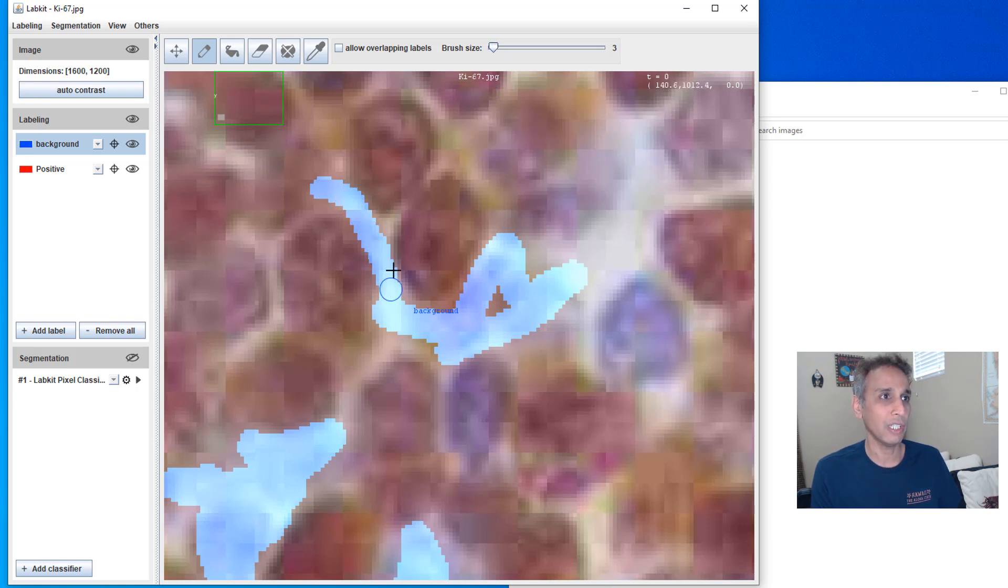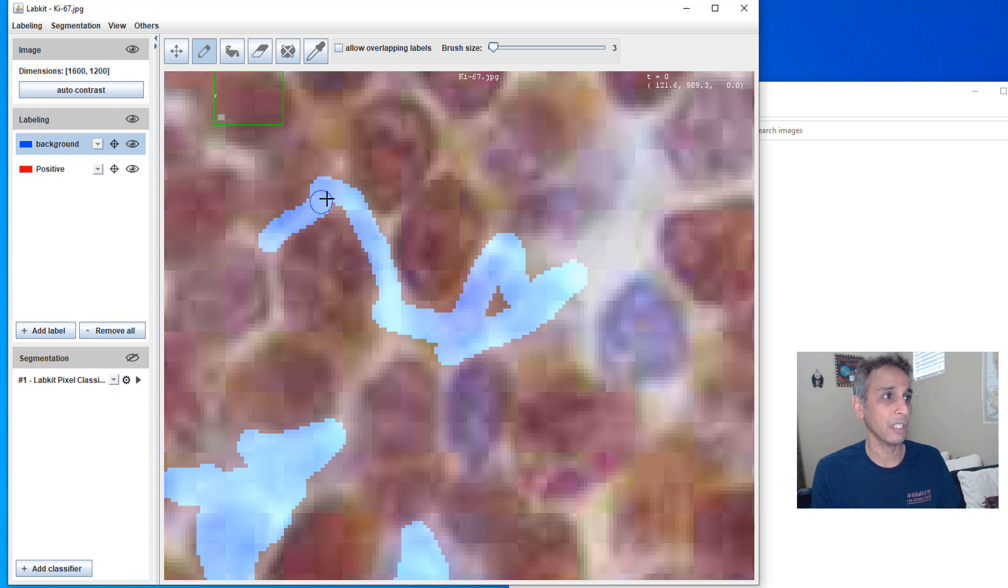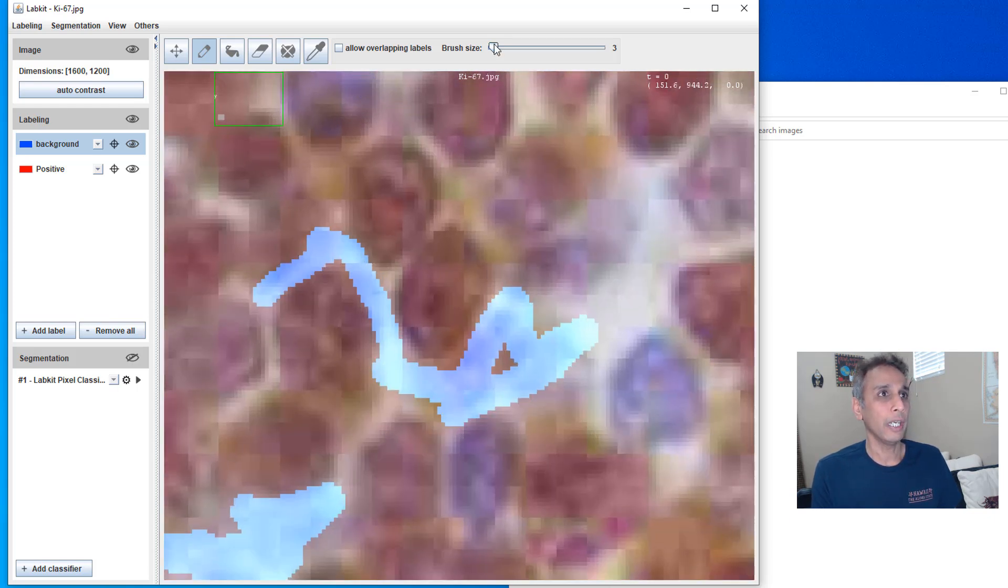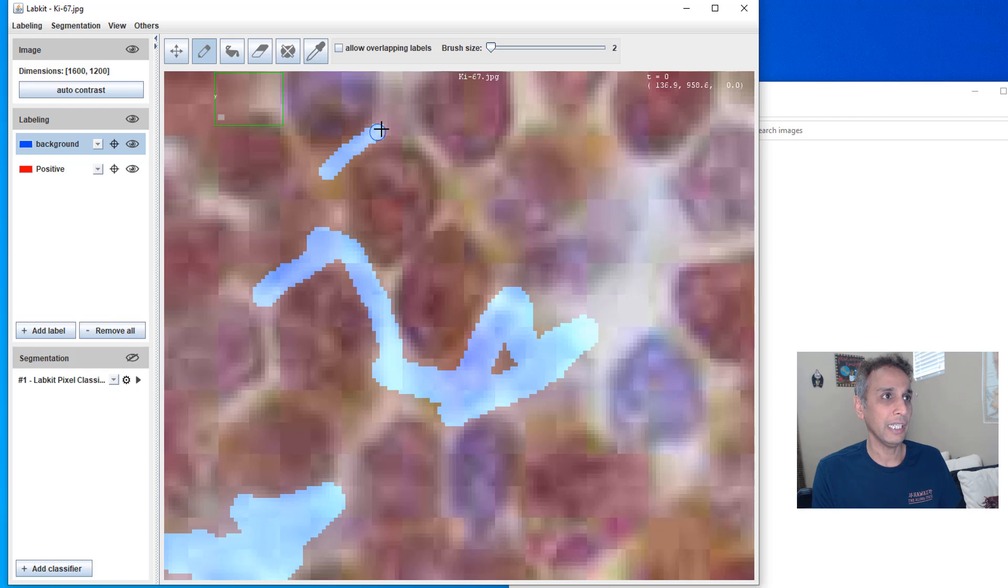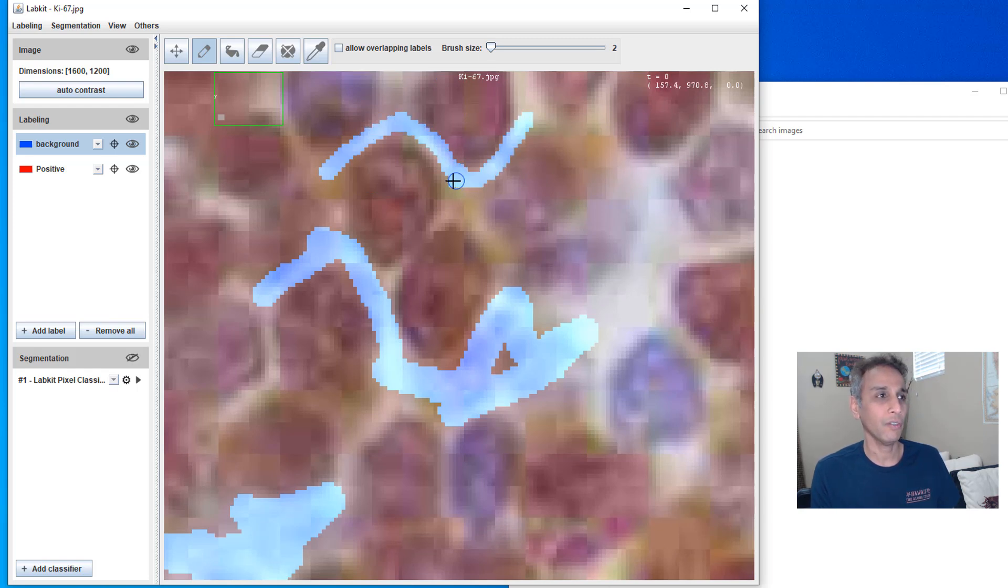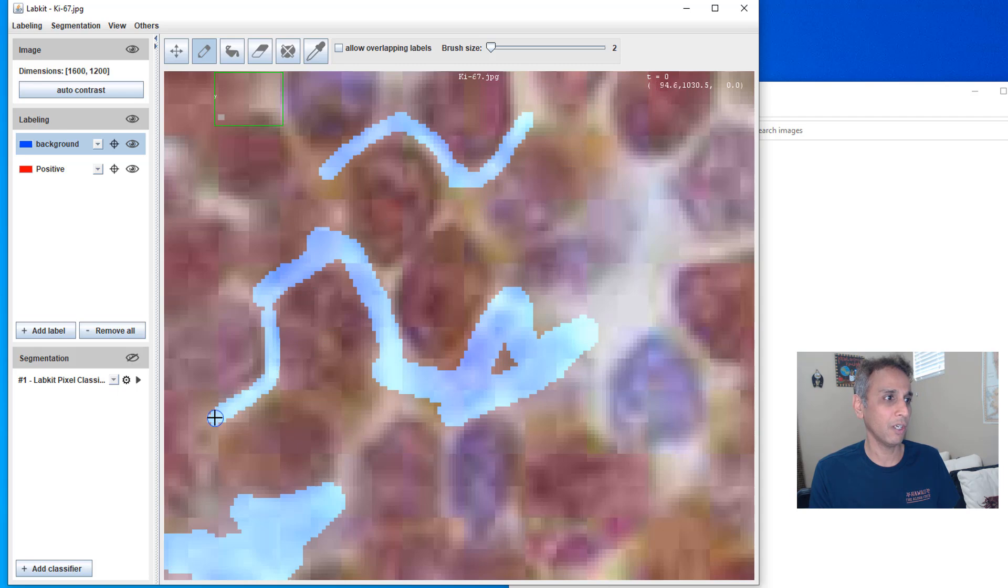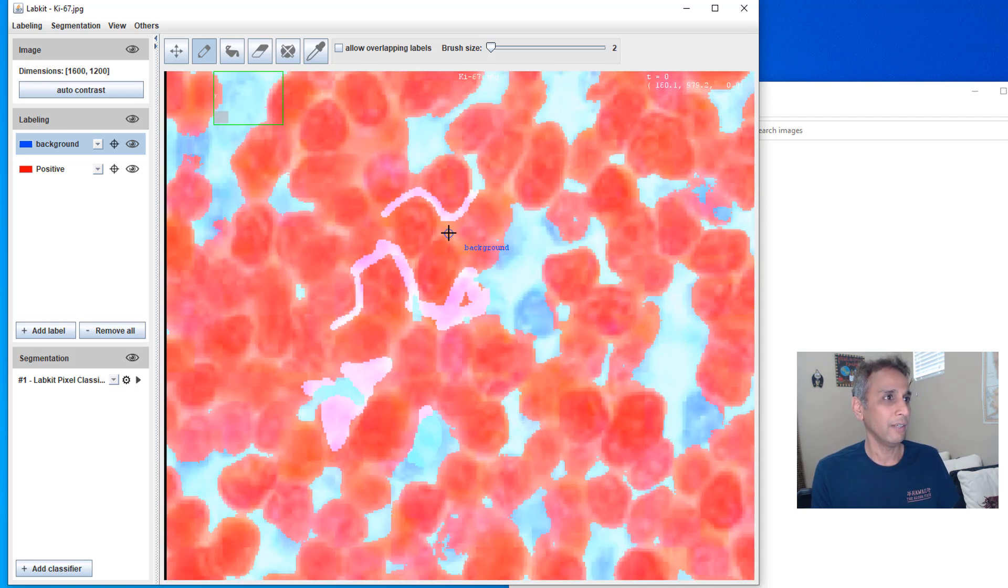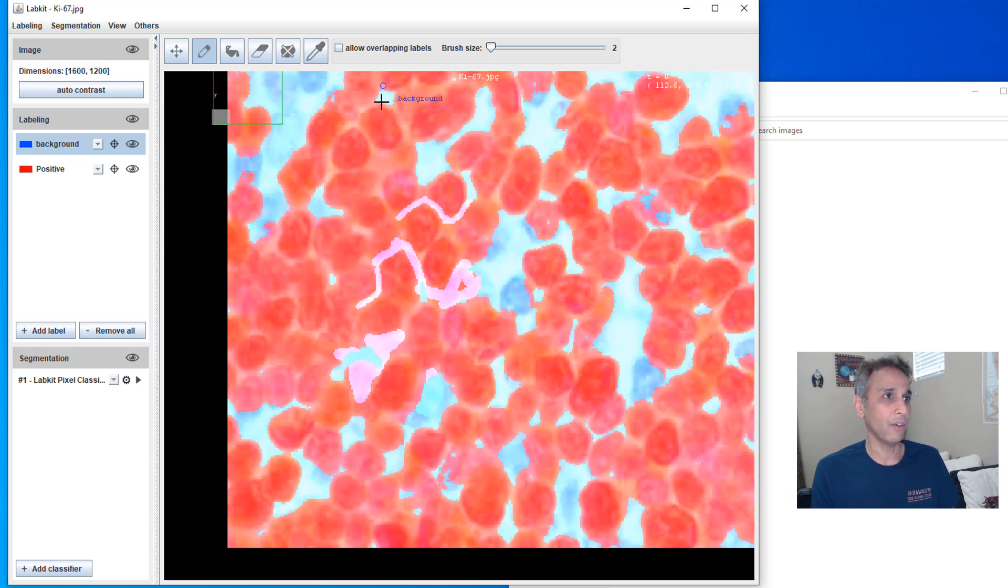And the key lies in these areas. Define the boundaries very well. Define the boundaries well. And let's do a couple more so you get an idea of what I'm trying to do right there. So I'm defining all of these boundary areas.